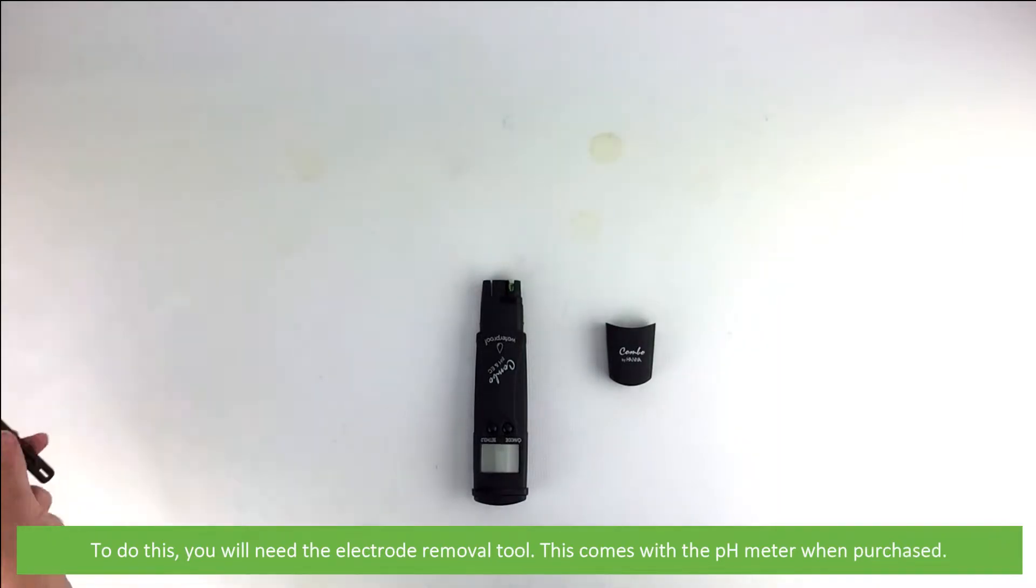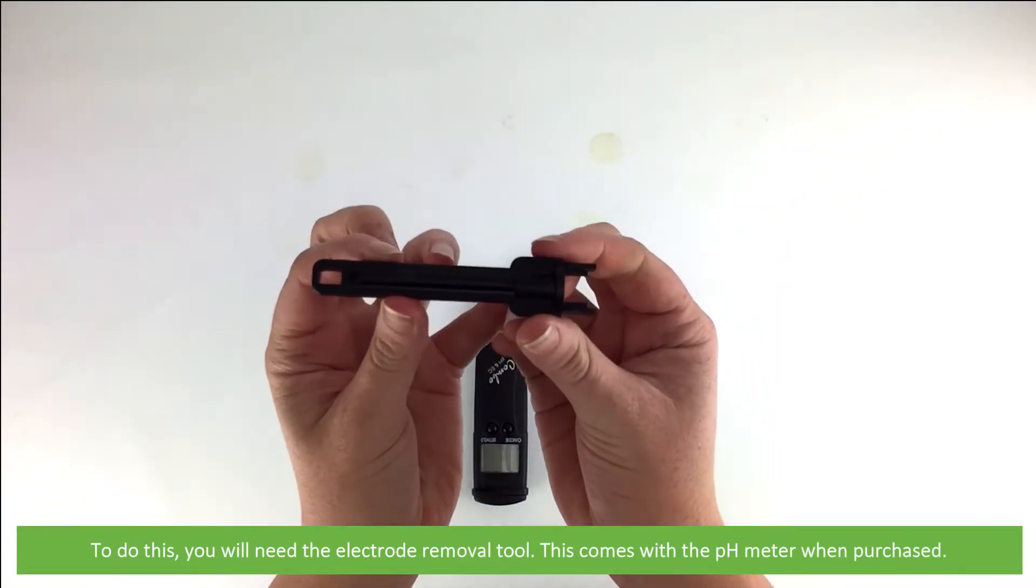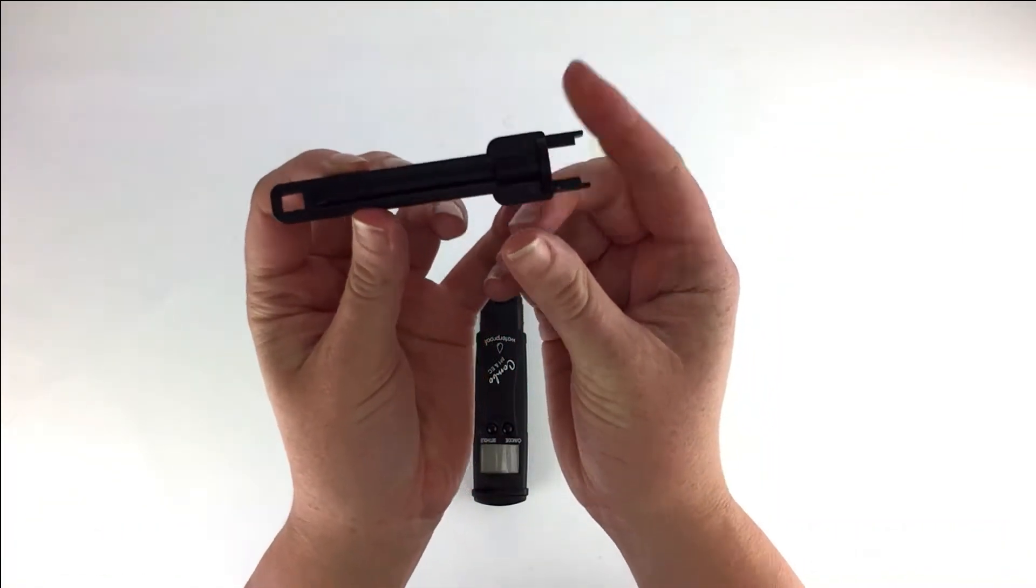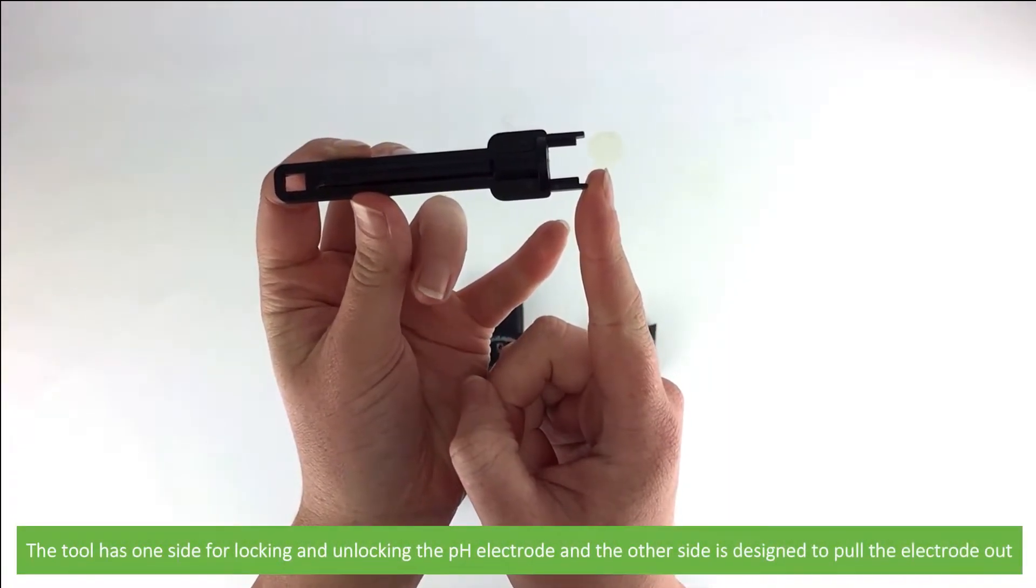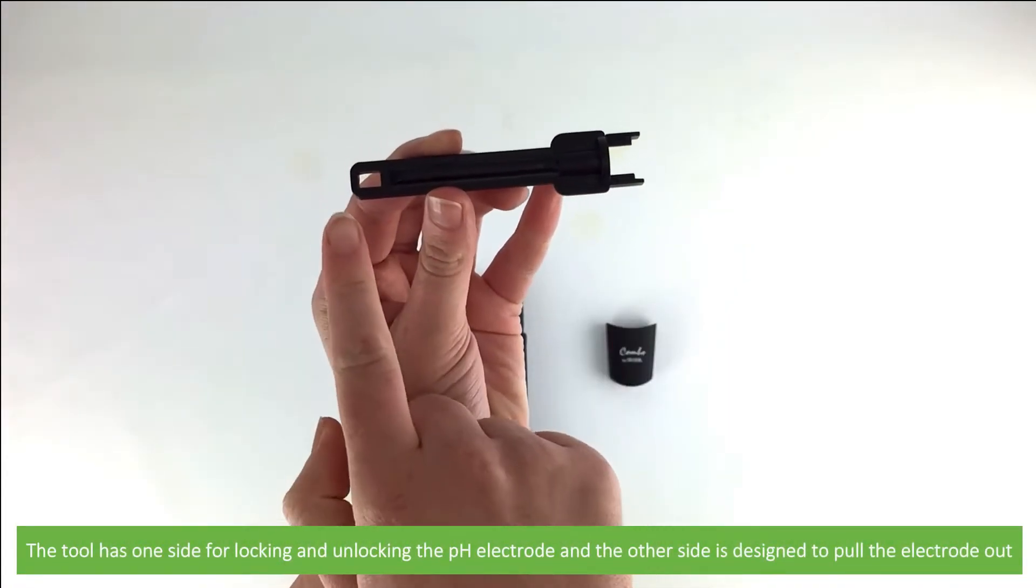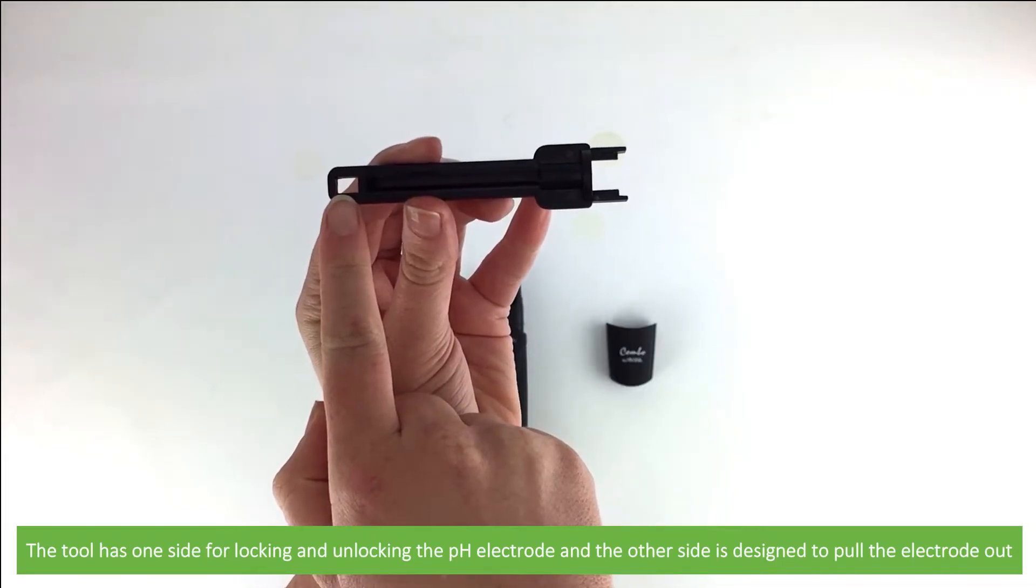To do this you will need the electrode removal tool. This comes with the pH meter when purchased. The tool has one side for locking and unlocking the pH electrode and the other side is designed to pull the electrode out.